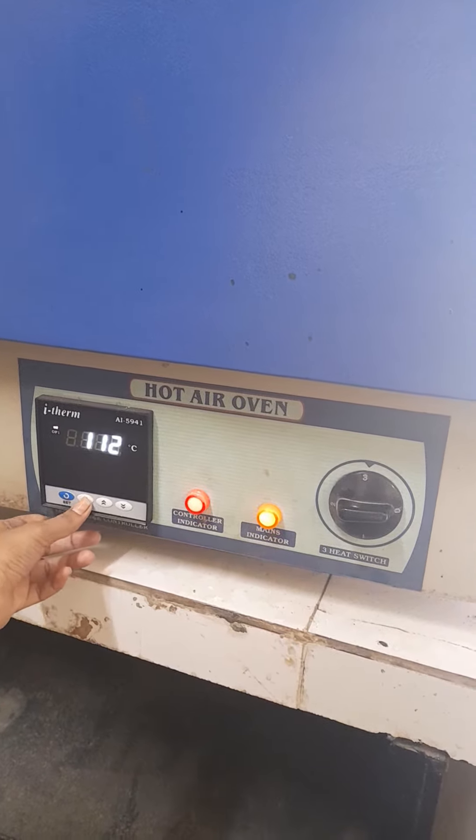For example, we prepare the TLC plate and place it in the hot air oven for drying. The temperature is maintained at 160 degrees Celsius for one hour. Then close the door.